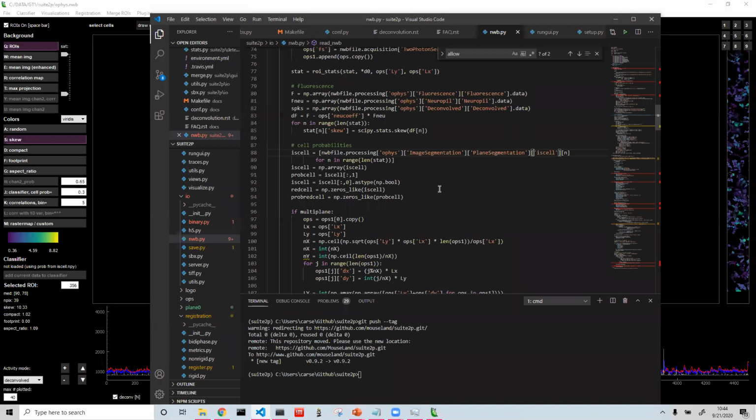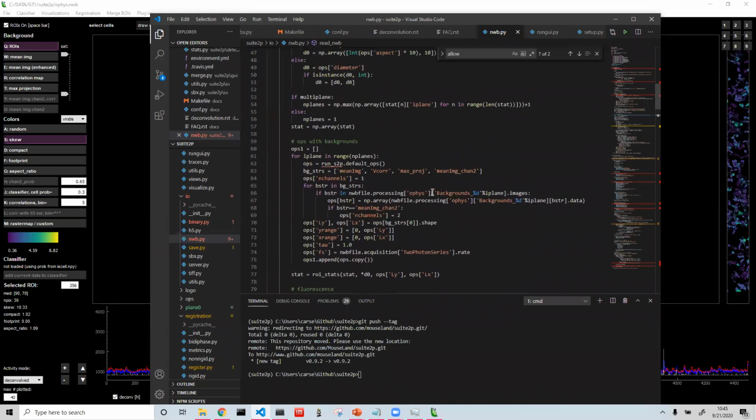But yeah, this is really great. This is such a powerful GUI. So really awesome work. It's great to see this as part of this ecosystem. Thanks. Yeah, thanks for the help at the hackathon. And yeah, I agree, I am happy to change. Oh, perfect. Okay. So I guess most of what we have to agree on is probably these backgrounds too, and how we declare these things, because these are useful for the user to see in the GUI for sure.